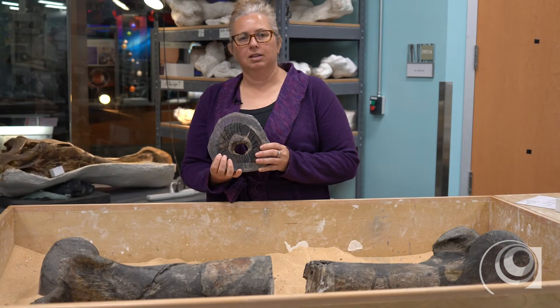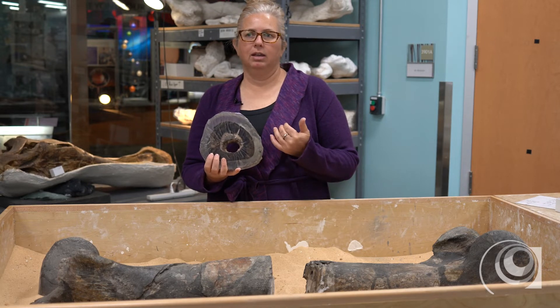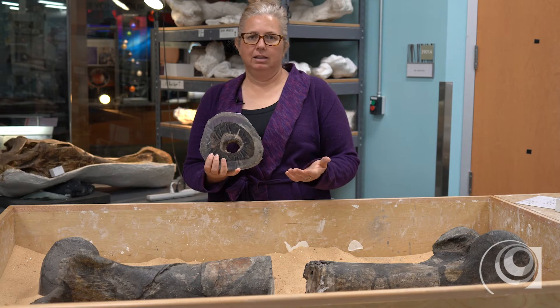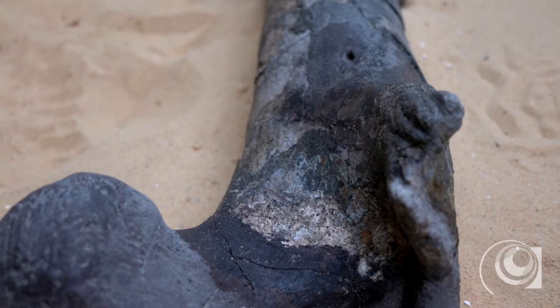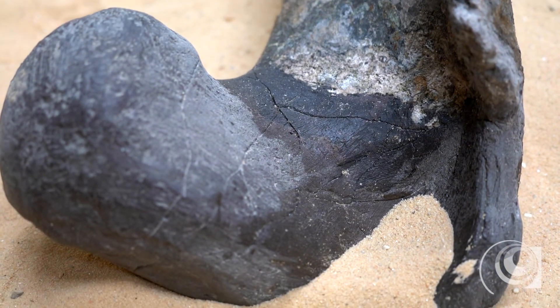One of the things that this can tell us is how an animal grew, if there's any sort of pathologies — meaning if it had any kind of diseases, it'll show up in its bone — and it'll help us understand how old this animal might have been when it died.